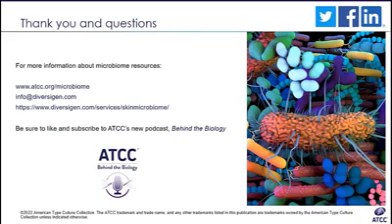Okay. And let's see, for the next question, how does the bias from 16S amplification compare to the bias from the library prep in shotgun sequencing?